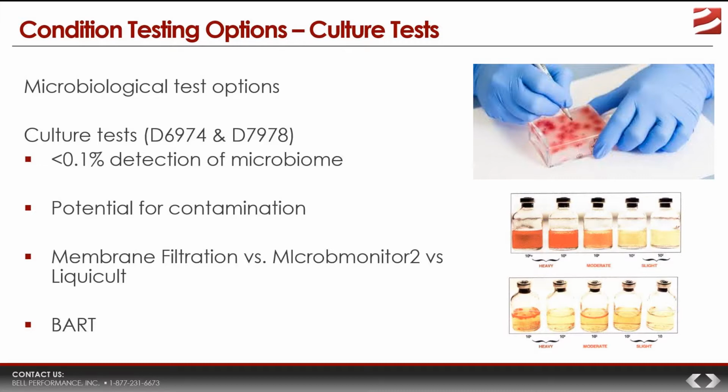And then there's the last one, BART. BART tests are kind of similar to liquid culture. They're packages of multiple bottles, and they actually enable you to grow specific kinds of microbes.